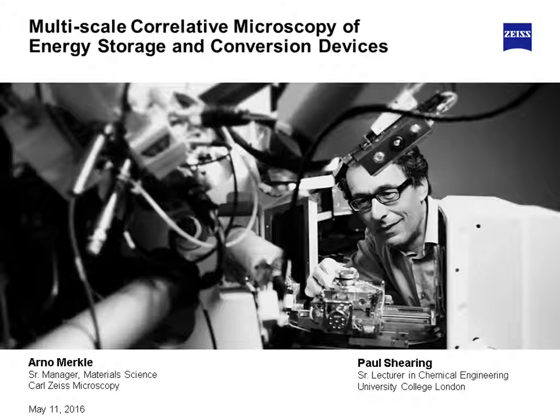I'll just jump in and say one final thing in addition to that, Arno, because we haven't really touched upon it today, just for time limitations. There's an enormous power in combining the images we're extracting from all these different modalities with computational simulations, so finite element or computational fluid dynamic simulations, which enables us to base our microscopic material simulations of flow or catalysis or diffusion or electrochemistry on real-life data.